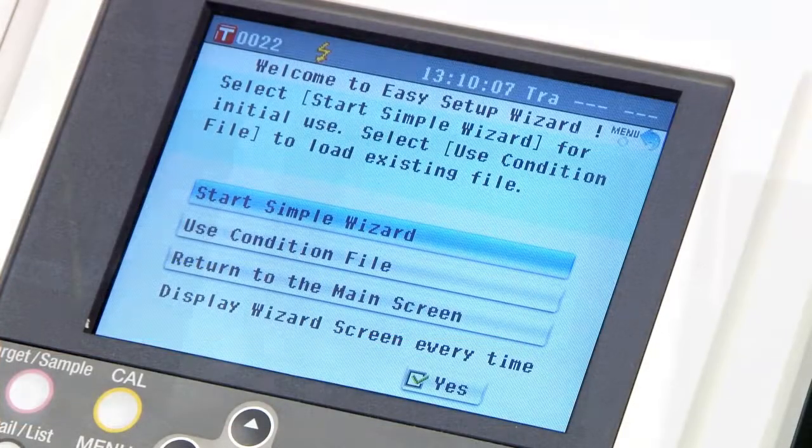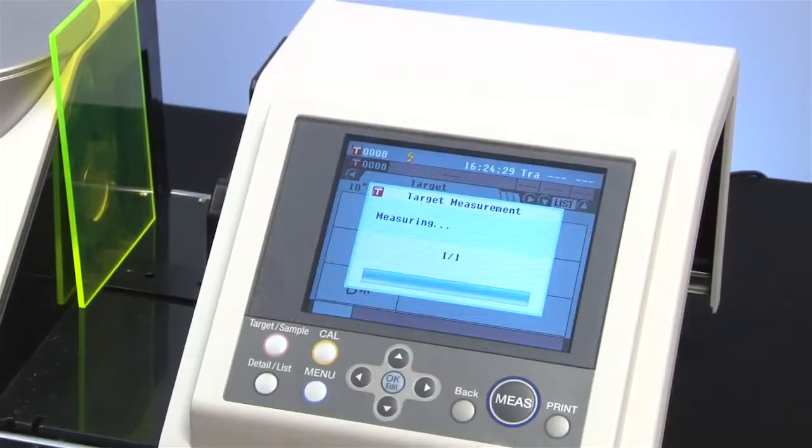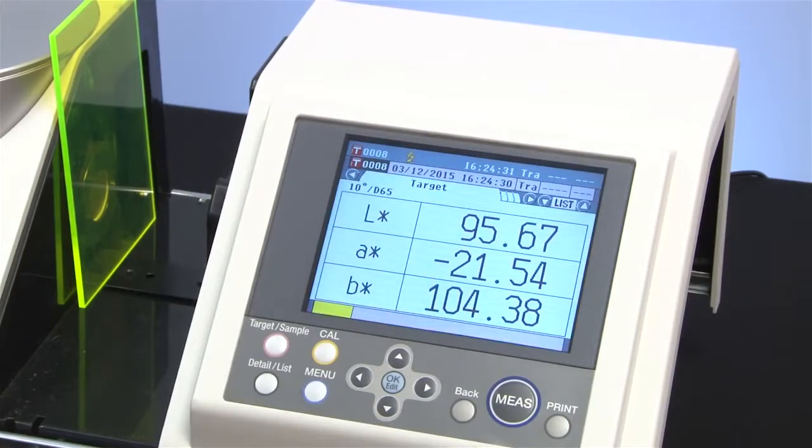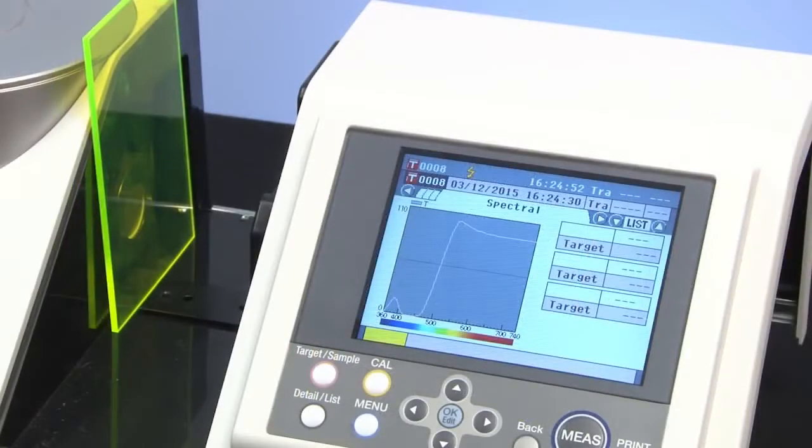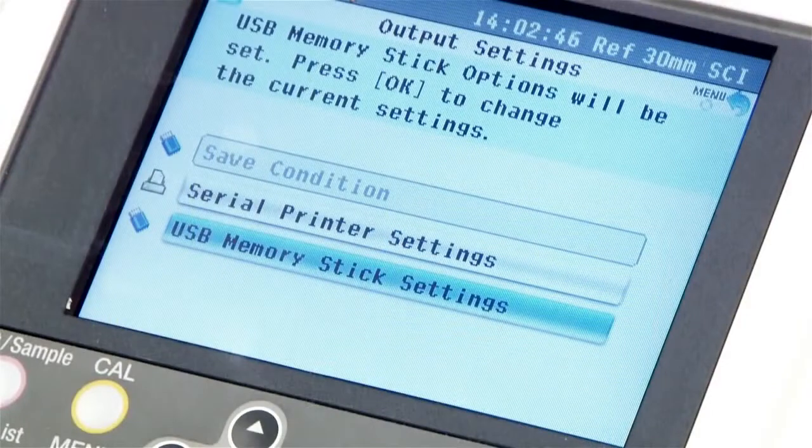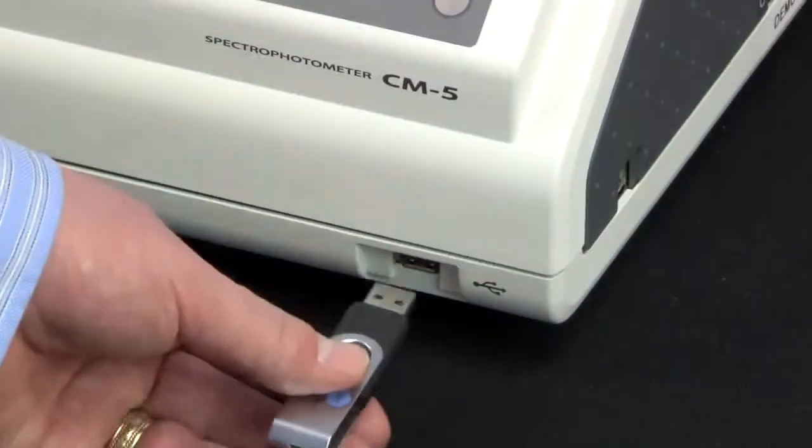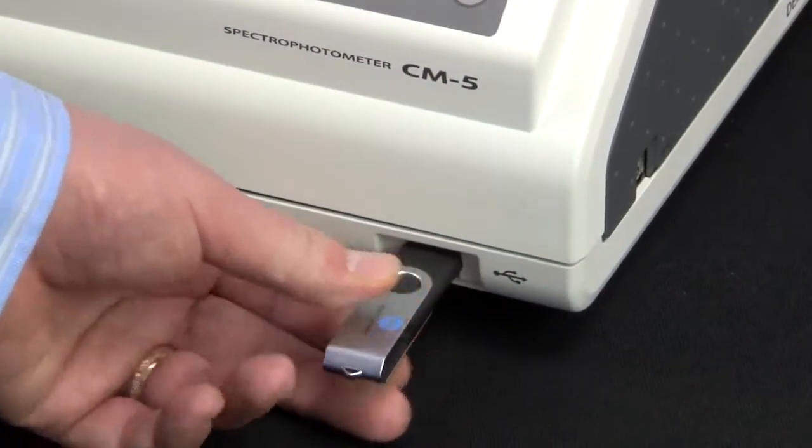With an easy-to-use wizard mode, measurements are performed by everyday users or occasional users alike. Stored data can be saved to a USB drive, making it easy to switch users and save settings without going through manual setup each time.